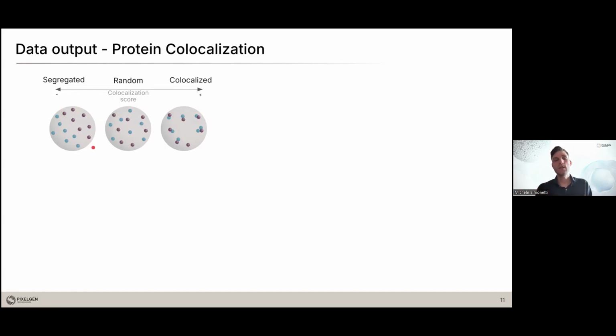You can imagine that this can happen, for instance, if you study immune cell migration. In that case, an immune cell forms a front and a back end, and you can see segregation between proteins. Or for instance, also to identify cells that are interacting. You can imagine that if you have a B and a T cell that are interacting, they have specific markers. And this is how you can use the score to identify which are the two cells that are interacting.